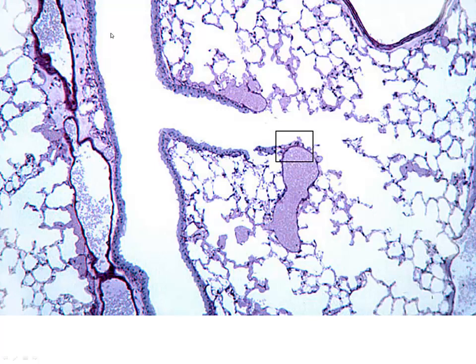Once again, a little bit closer look at that previous section. We have a lot of blood vessels present here. That's what we're looking at. But we have intact mucosa. So these are going to be bronchioles, no cartilage. Bronchiole coming out, we begin to see the interruption. So we're going to say respiratory bronchiole, which makes this a terminal bronchiole. And then past this point, we have alveolar duct. Alveolar duct here. Alveolar duct here, with each one of these little compartments being an alveolus.